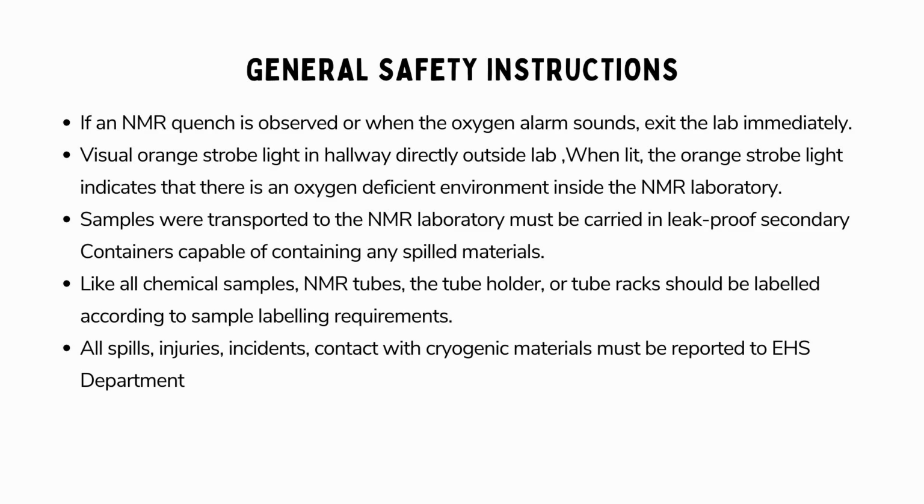Transport all samples to the NMR lab in leak-proof secondary containers to prevent spills. Label NMR tubes, tube holders, and racks in accordance with the sample labeling requirements. Report any spills, injuries, incidents, or contact with cryogenic materials to the Environmental Health and Safety Department promptly.